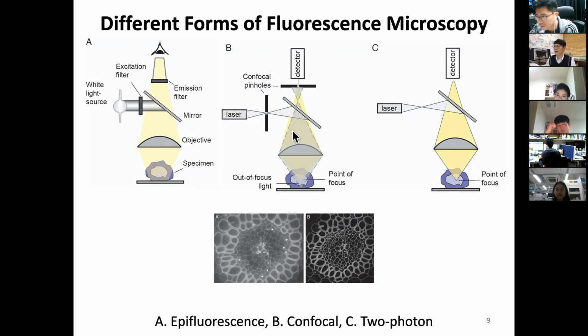So if you look at this one, this is one lens, okay? This is the focus at the tip of the yellow one. Then the light coming from this point will come out, diverge. And this lens, what does the lens do? It bends the ray of the light. So it converges back to a point here. So that's an image. If you make these points along the two dimensions, this is a point.